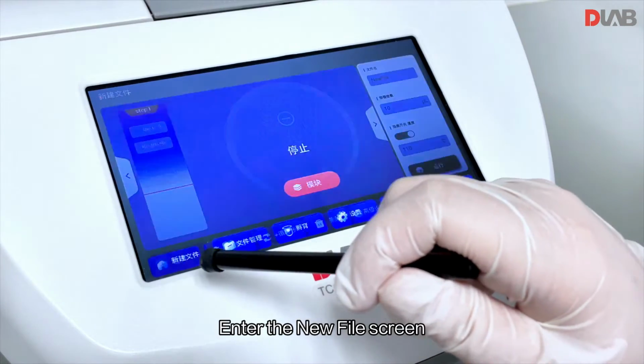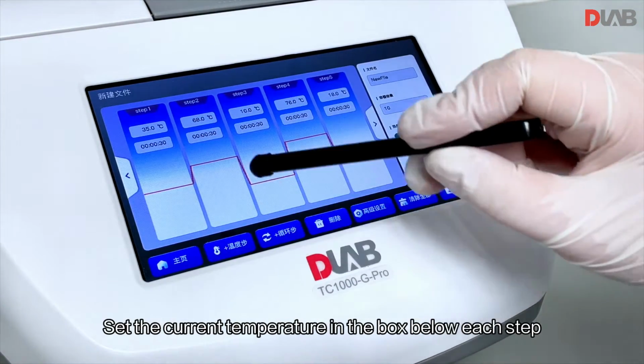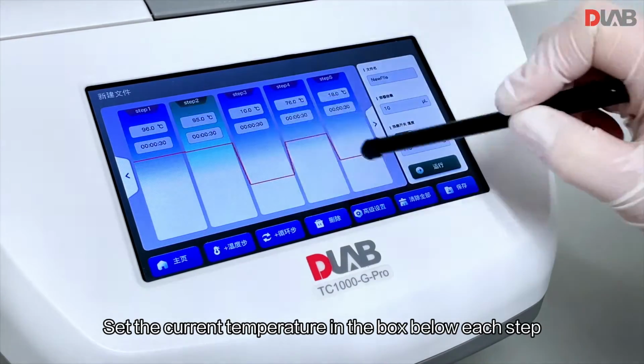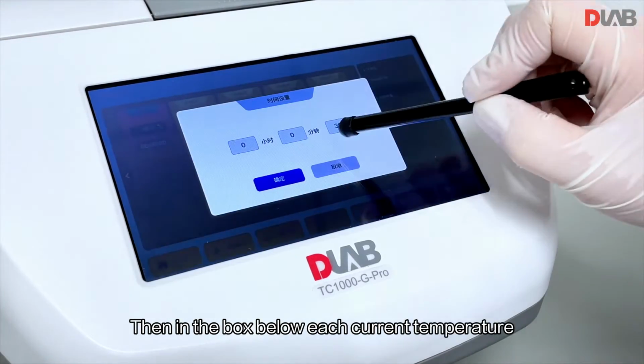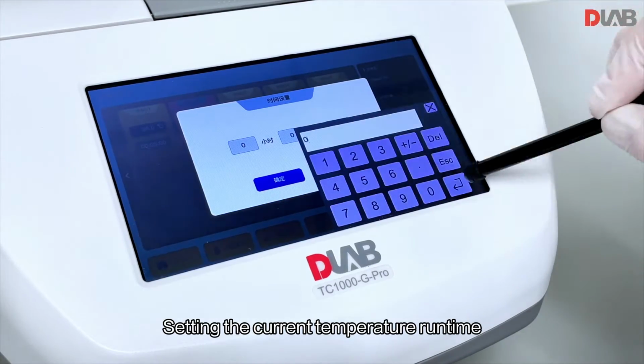Enter the new file screen. Click on plus temperature step to add the program temperature step. Set the current temperature in the box below each step. Then in the box below each current temperature, set the runtime for that temperature.